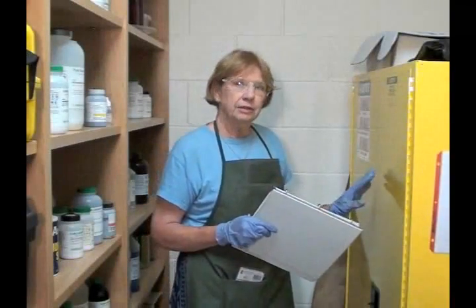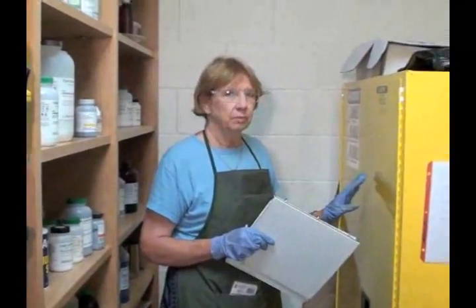The flammable cabinet is where you might find your major problems. Frequently there are chemicals in here that are high risk. Especially keep in mind that there are some solvents that are called peroxide formers, and that means that when they get old and exposed to air, they will form peroxides that are extremely flammable and even explosive in some cases.